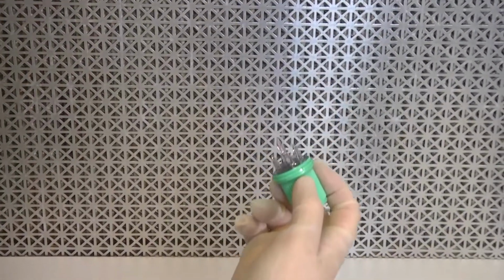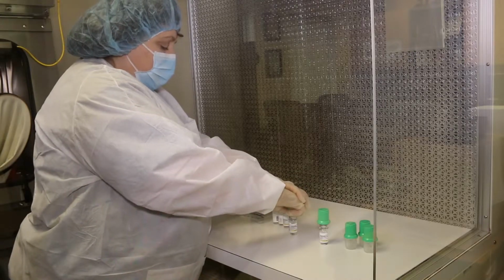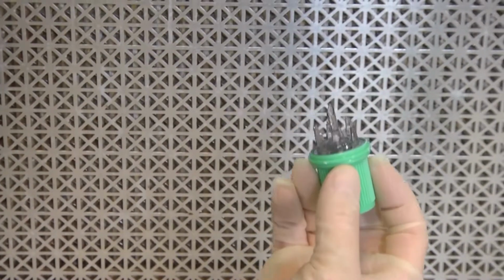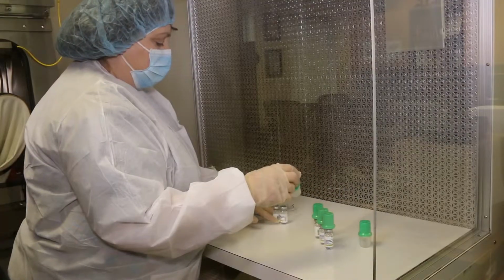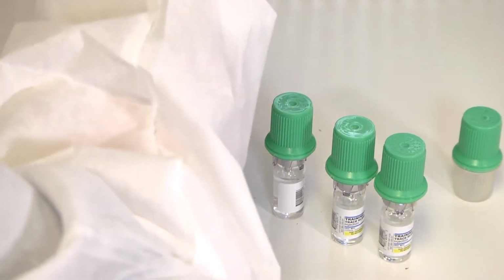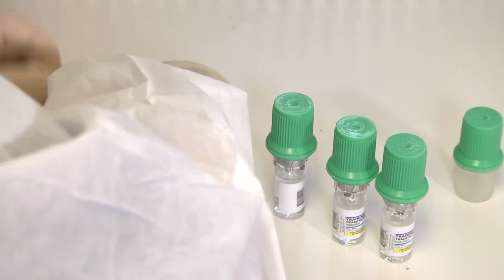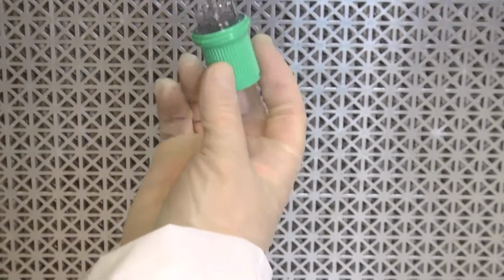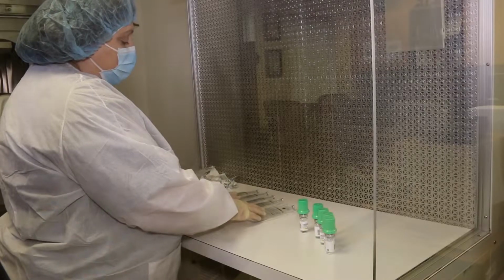Okay, again, the eye of the needle is facing me. I'm going to put that eye of the needle facing me, straight in, and attach. Another one. Turn it so the eye of the needle is facing me. Attach. Take off the spike. Turn the eye of the needle facing me. Attach. Last one. Eye of the needle facing me. Attach. Now these are ready to attach to your IV bag.